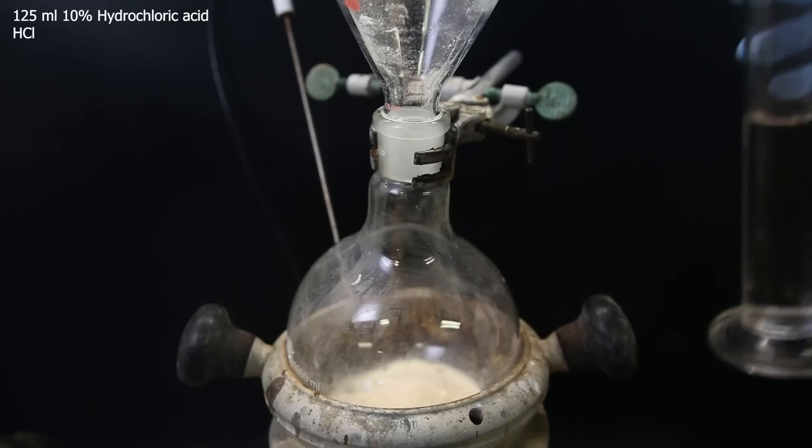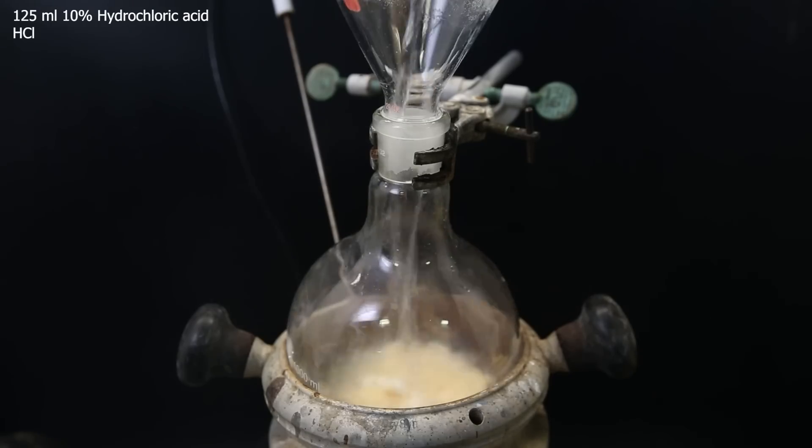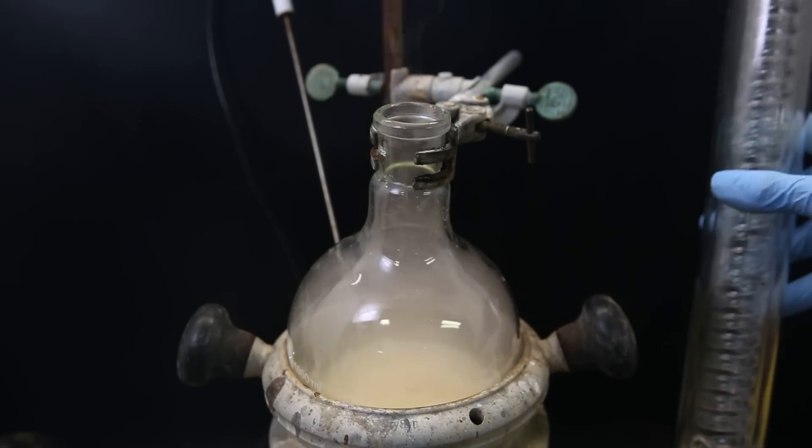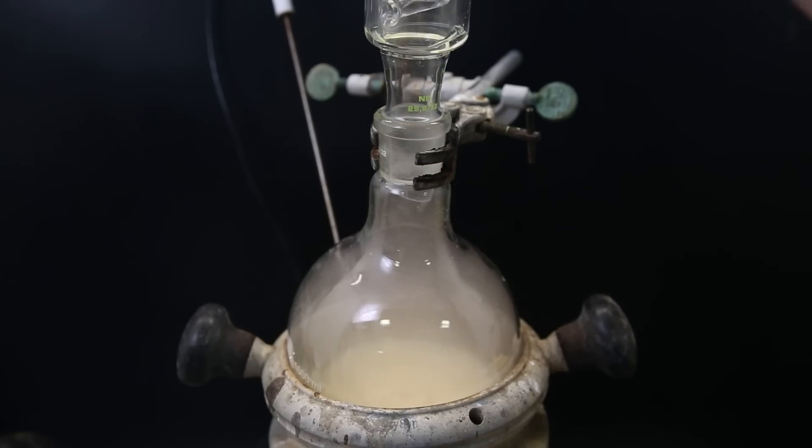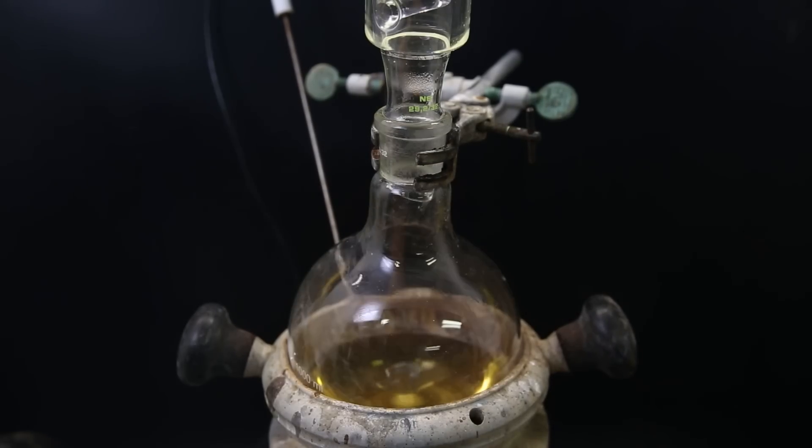Then add the solvent and the acid, 125 mils of 10% hydrochloric acid. I then attach a condenser and heat this mixture to a reflux for 5 hours.